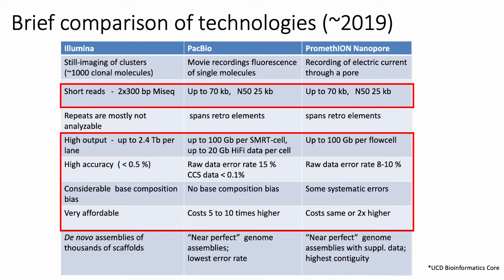We'll talk later about PacBio sequencing, but you can achieve a higher accuracy in PacBio because essentially for any given fragment, you can actually sequence it multiple times, which would obviously decrease your error rate over time. But if you were to only sequence each fragment once, then Illumina sequencing generally yields higher accuracy.